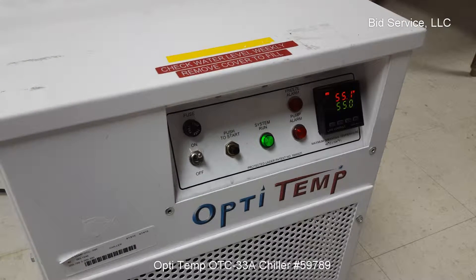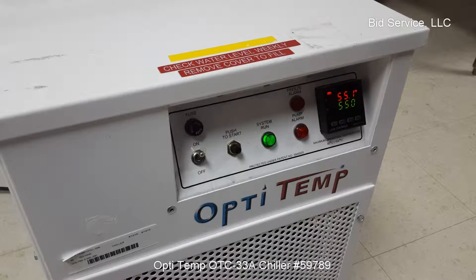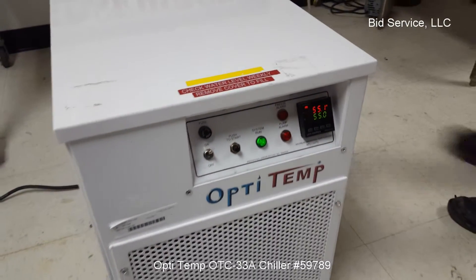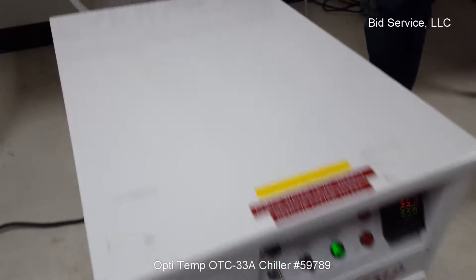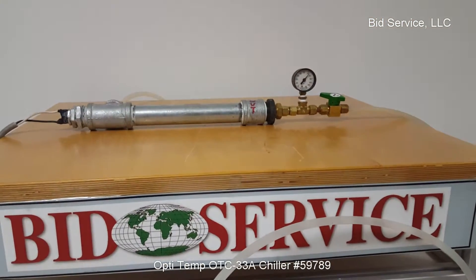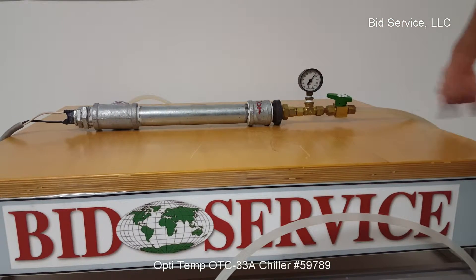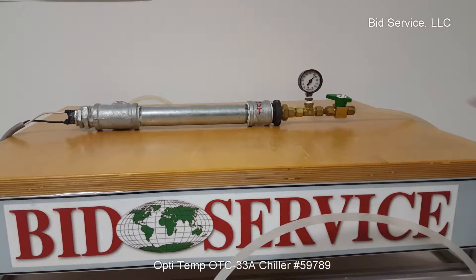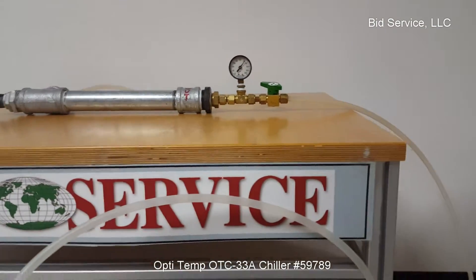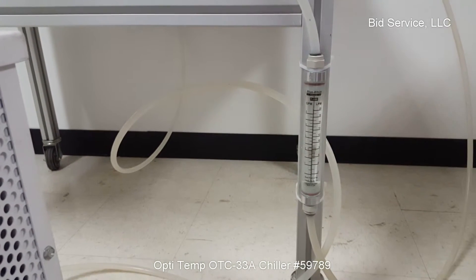This is the OptiTemp chiller. We have it set for 55 degrees Fahrenheit, and we have a load here with the water heater in it. Just to see what the flow is at 65 PSI, I restricted the return flow and included a flow meter. At 65 PSI, you can see we have a little over 2 gallons per minute.